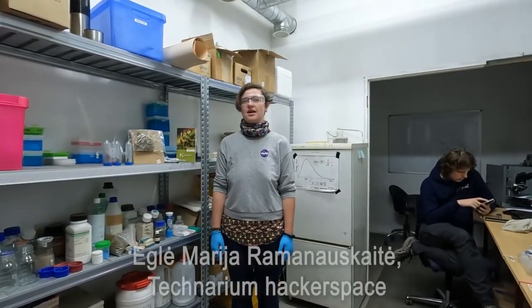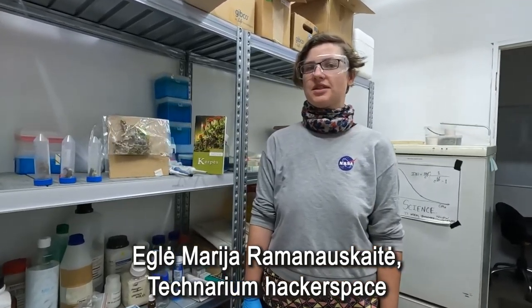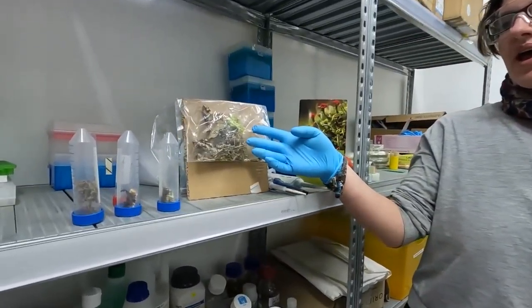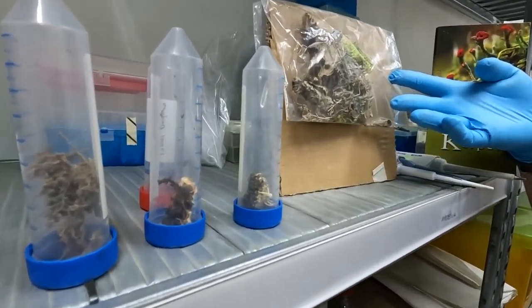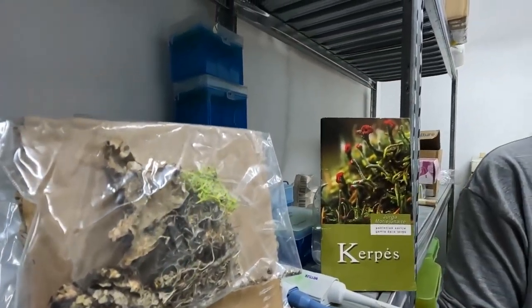Hello, this is the Biolab at the Technarium hackerspace in Vilnius and we're doing some citizen science experiments here. One of them is lichen biohacking where we invite people to collect lichens and then extract DNA from them and then we look for genes with new biomedical properties.